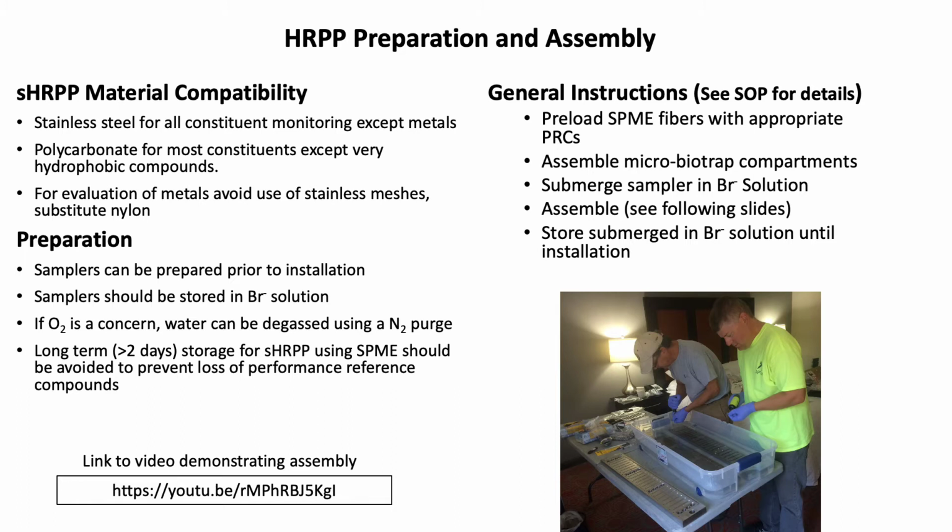Also, for evaluation of metals, you should avoid the use of stainless meshes. Nylon meshes are available. So throughout the presentation, if you see stainless meshes but are interested in heavy metal or metal monitoring, you can simply substitute those stainless meshes with nylon.